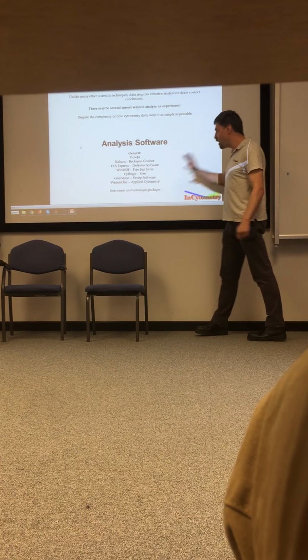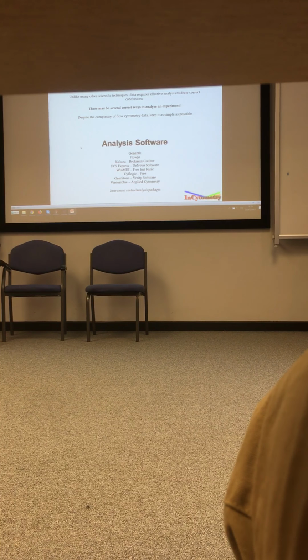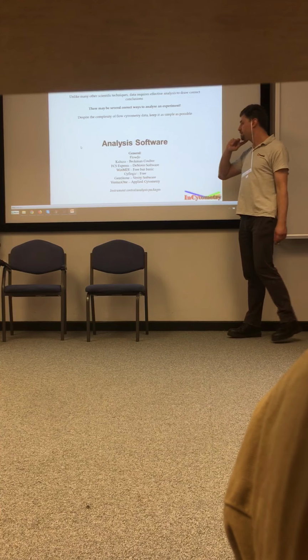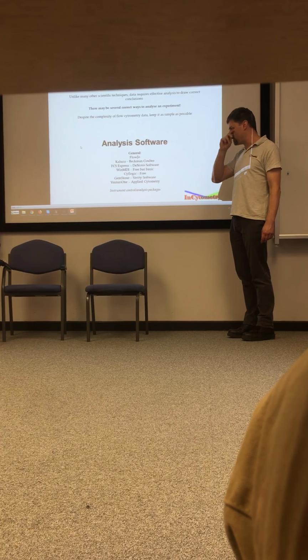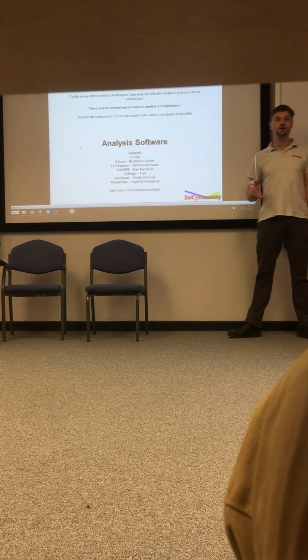So basically there's a load of different softwares, but when it comes down to it, they all operate the same way. So much so that I was asked to go and do some hands-on training for an instrument I'd never used before, on a software I'd never used before.